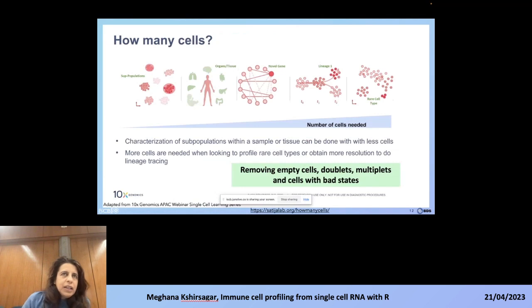For any experimental setting, like the COVID-19 example, you could scale up from thousands of cells to millions of cells. So what is the minimum threshold to set up a single cell experiment? How many cells do we really need? Because among the cells captured, some would be multiplets, some doublets, and some dead cells. Even after removing those, how many viable cells do we need for the experimentation? It depends on the kind of hypothesis that you will be testing.